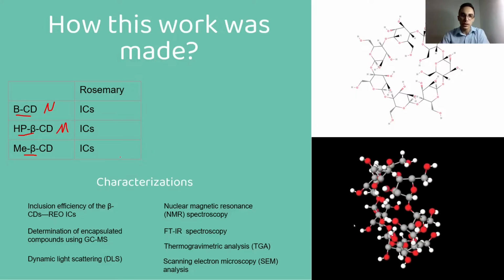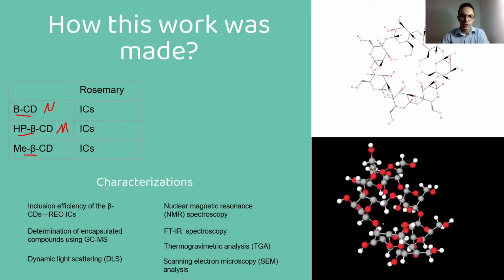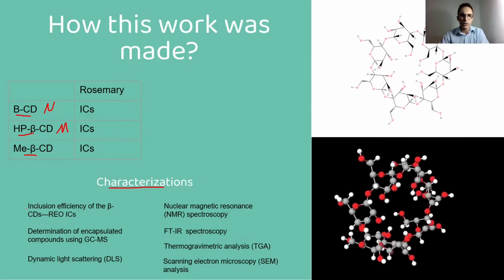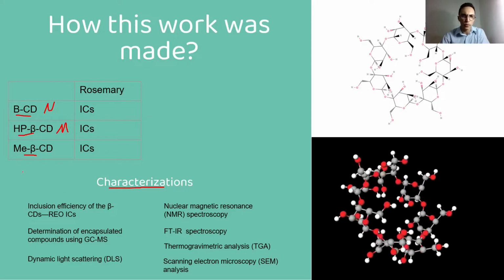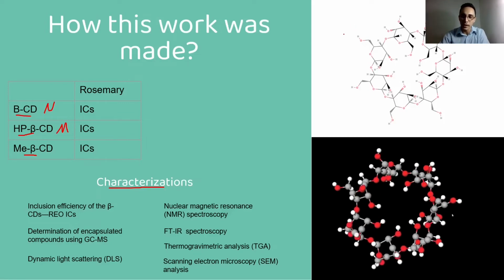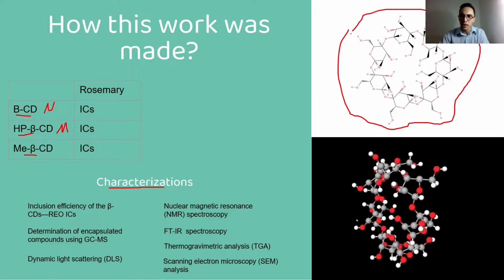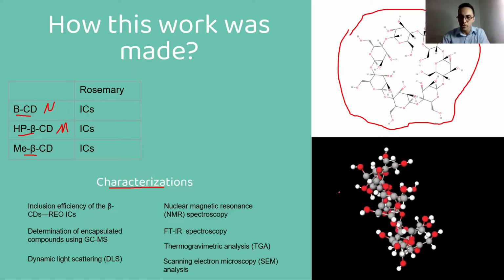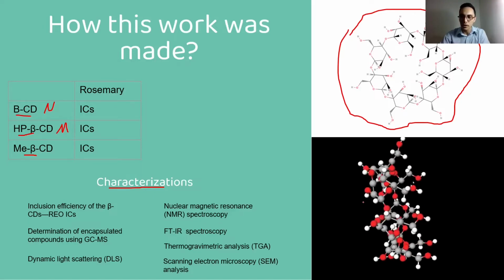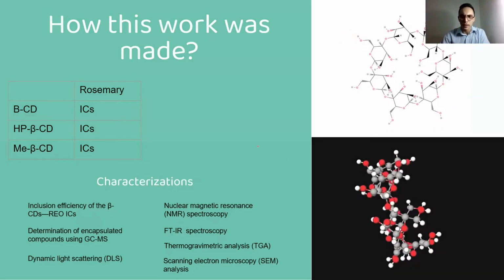What does the author want to see? The author does characterization to see how the inclusion complex was formed between cyclodextrin and rosemary essential oil. And here we have the structure of beta-cyclodextrin, and some 3D structures of beta-cyclodextrin.